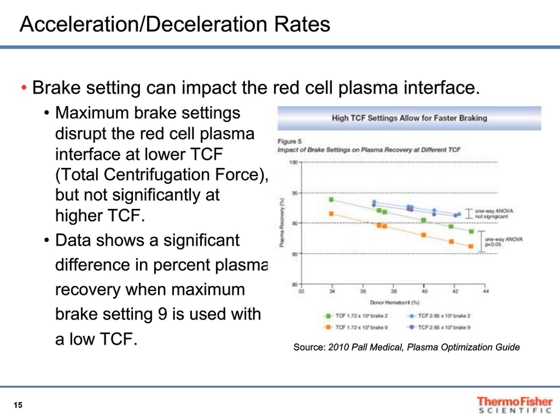So on the way up, you don't want to disturb that gradient you created, and therefore your separation is doomed from the start. And then on the way down, once you put all that energy in and created a separation, you don't want to shake it up and then undo some, if not all, the work you did in the run.